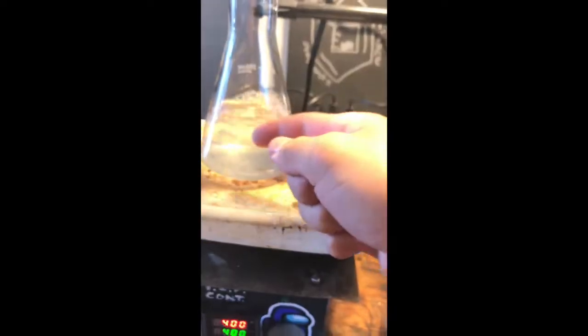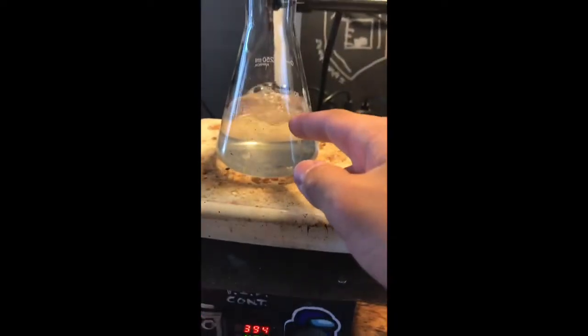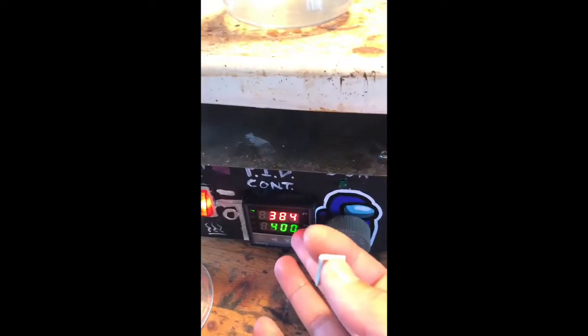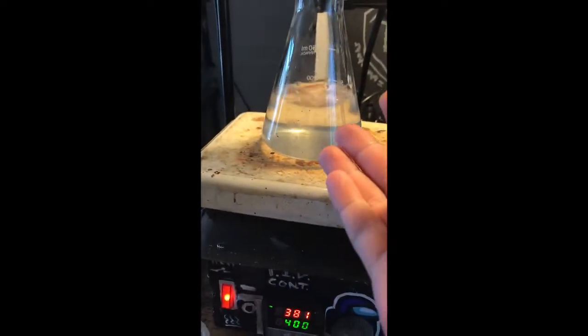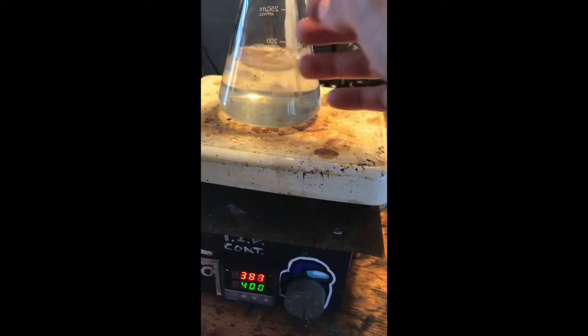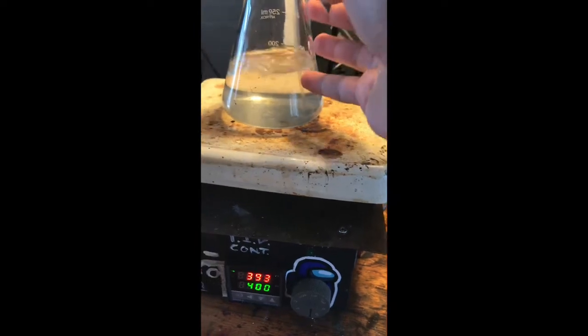This is sort of just a PSA. Make sure to put boiling chips in your flask before heating it, because otherwise you will end up with a fountain such as this. In this case it was acetone, fairly benign, but it's still not really a good idea.